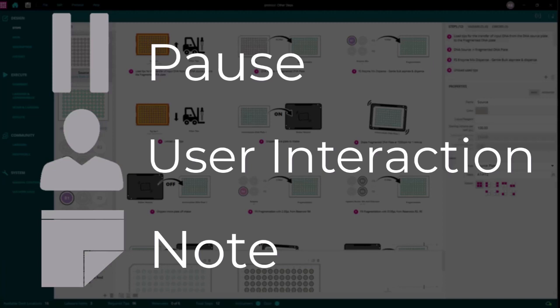Note. This gives the user information about what is happening or what they may need to be doing whilst the protocol is running. This will have no impact on how the protocol runs and should be used for reference only.